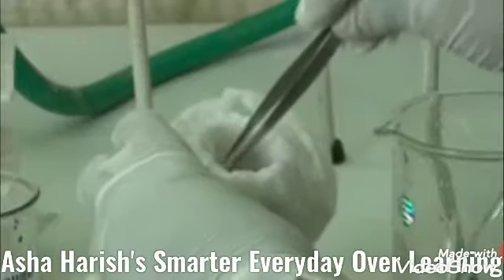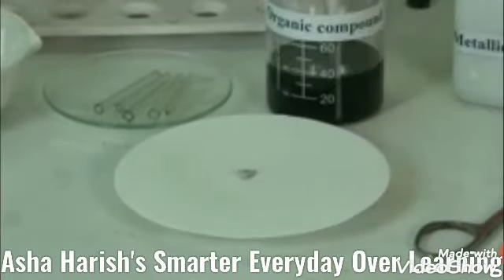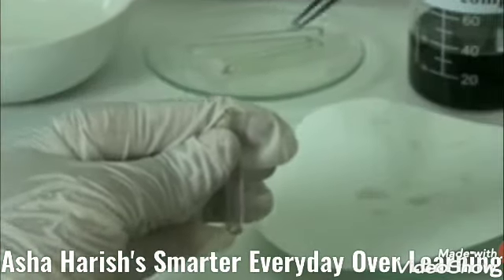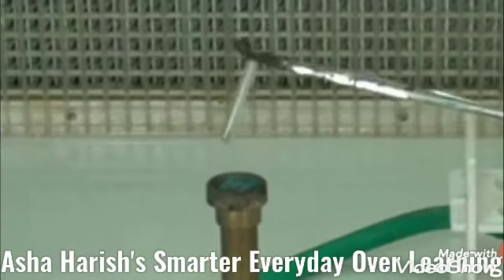Right, now let's see the procedure. First of all, you have to take with the help of forceps a small pinch of sodium metal, that is freshly cut sodium metal, the size of just a pea. It is heated gently in a fusion tube, which you take with the help of forceps, and this is the tongs. With the help of tongs you need to place that fusion tube on the Bunsen burner.